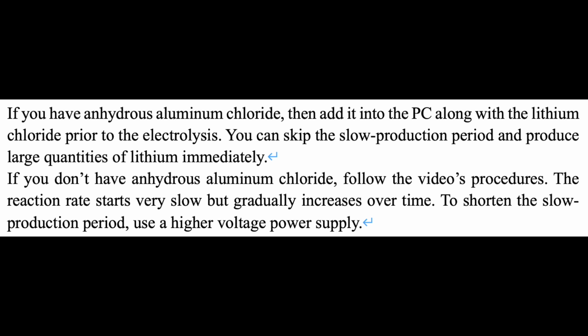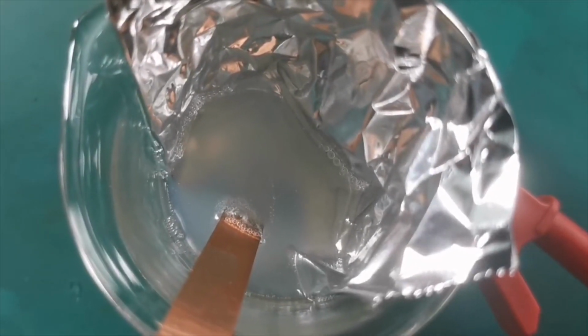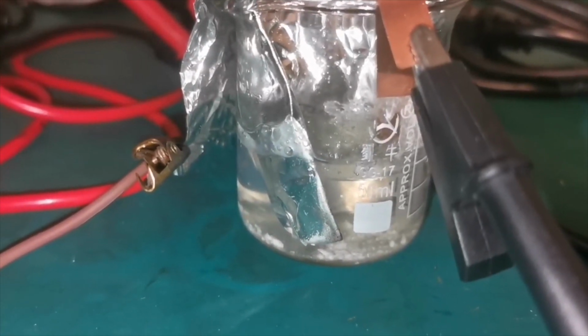The reaction rate starts very slow but gradually increases over time. To shorten the slow production period, use a higher voltage power supply. Note that this in situ aluminum chloride generation method doesn't work with sodium production, because the sodium chloride is practically insoluble in PC and cannot conduct even a little bit of electricity to get the reaction started.